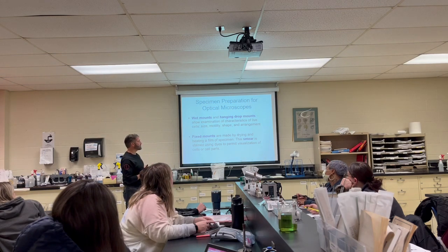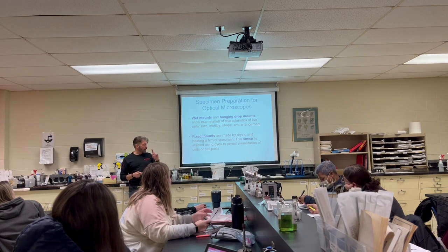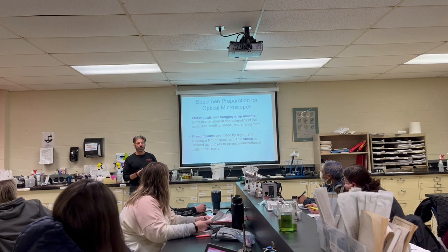The smear is stained using dyes for visualization of cells or cell parts. When I first taught the course, Dr. Rowe told me, here are some slides, heat fix them and have the students look at them. They were not stained. How do you think that went after about an hour in lab?